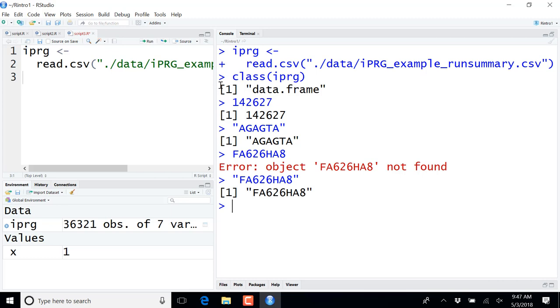I take any row of that data set, and then I know exactly what I have at every position in that element. Similarly, any column that I take, for example, this column here, I know I have a variable. I know that I have intensities for all the proteins. I know that they're all the same element, the same class, in this case intensities, but in addition to that, I know that they record the same value, kind of the same quantity, which is an intensity.